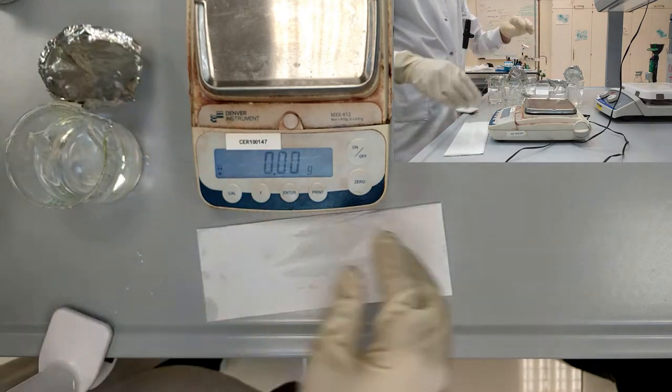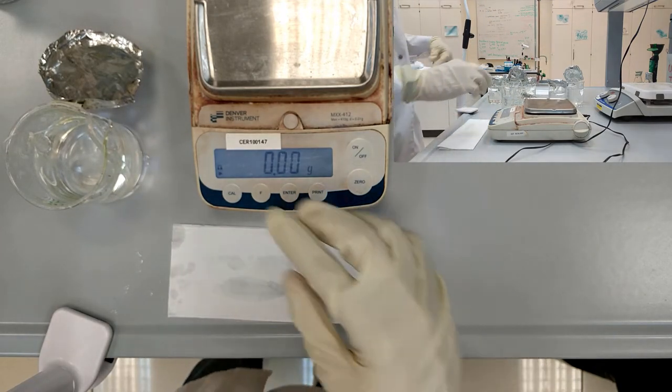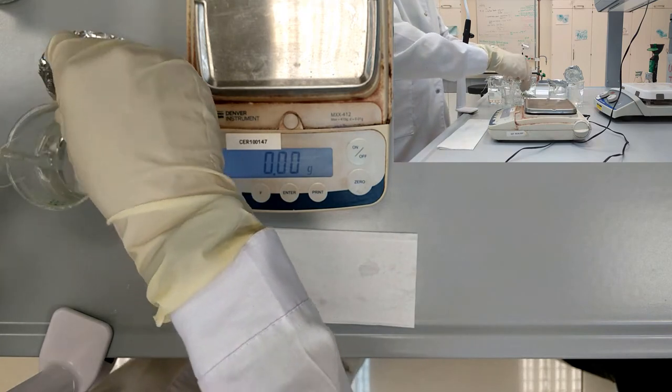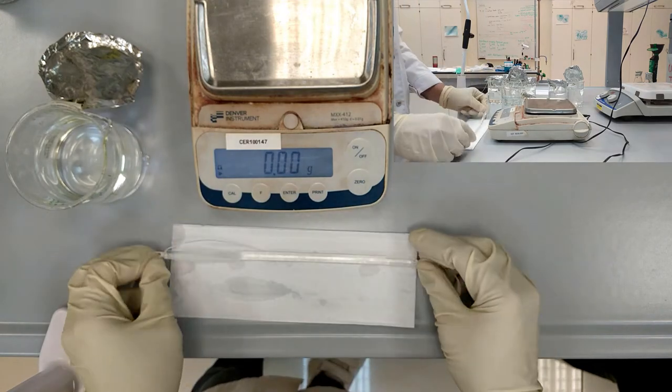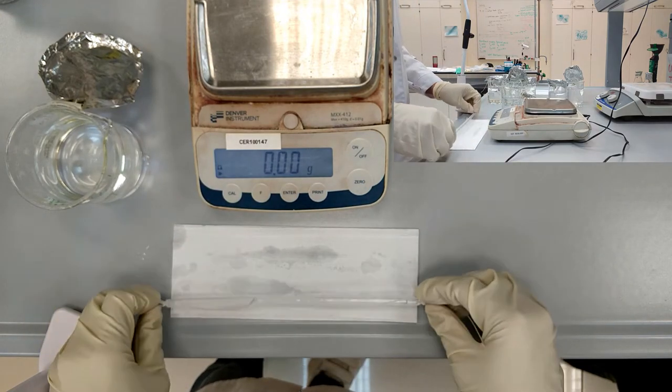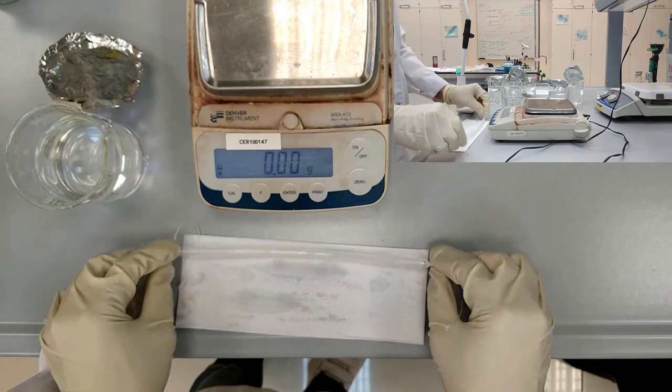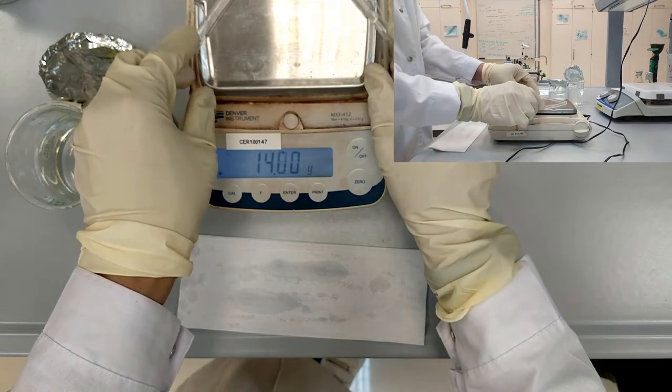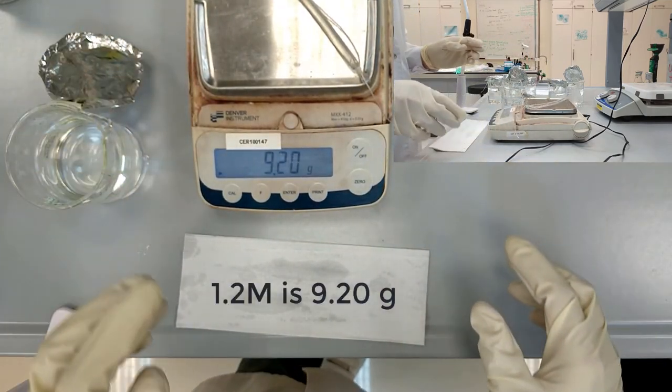Now we take the tube with 1.2 molar concentrated glucose inside. This one was put in the water. Its mass is 9.2 grams.